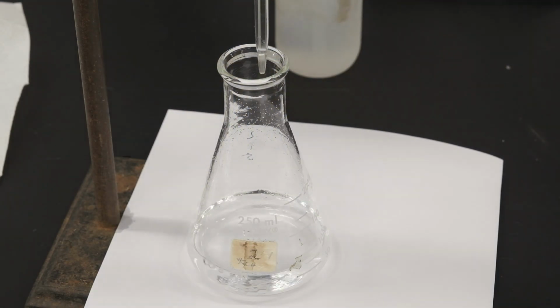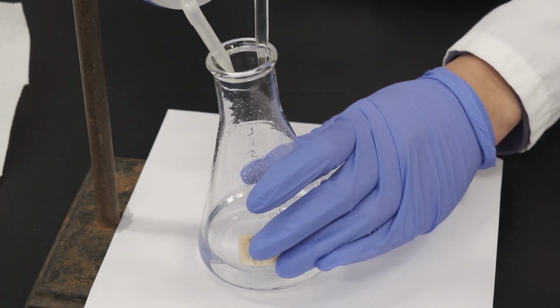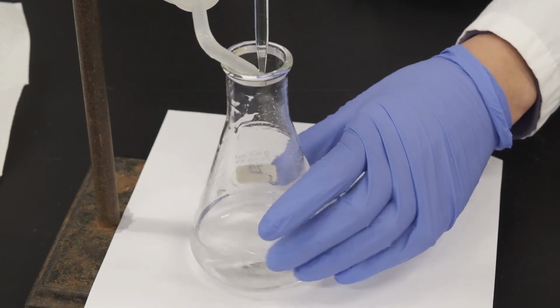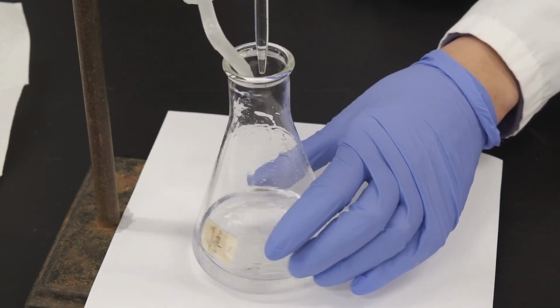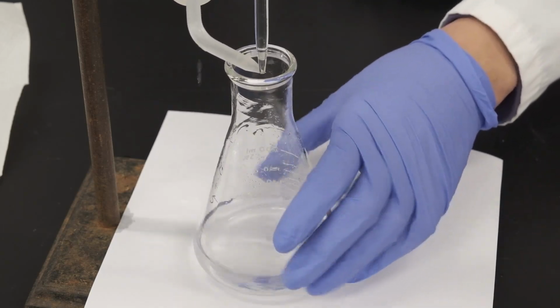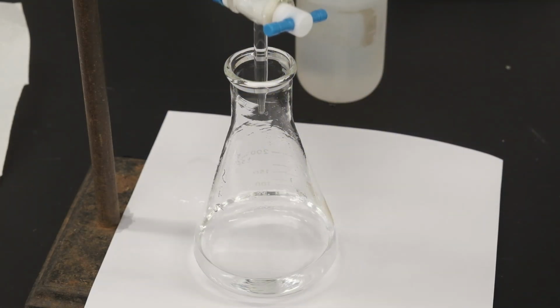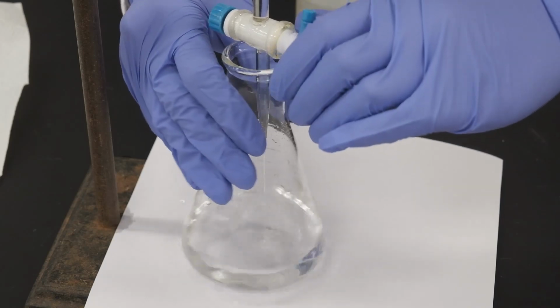And every so often, we're going to add deionized water along the walls to get any of the solution. And continue adding.